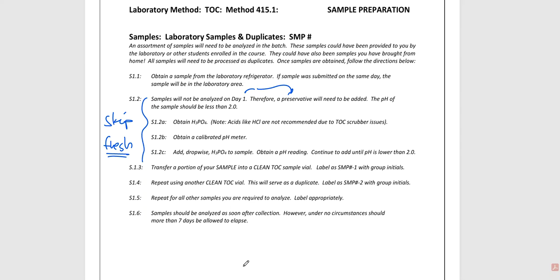If we bring our own samples in, we will also try to do that more or less for the most part of the time. We will try to go to the river. We will get them that morning. We'll have them ready to go by the time that you come in the afternoon.